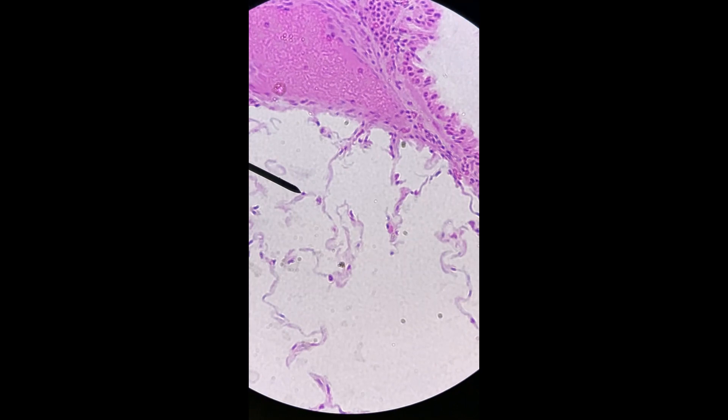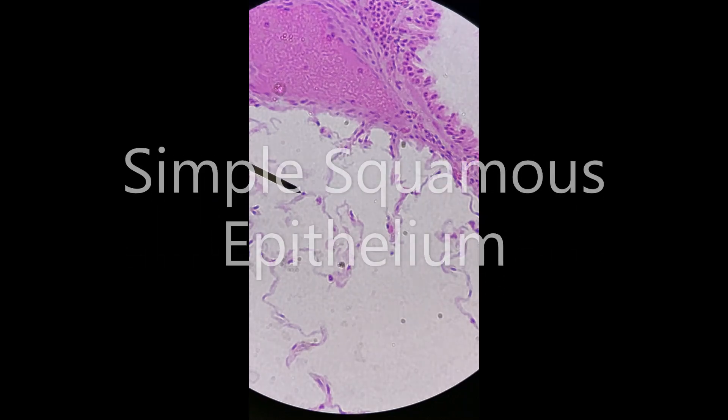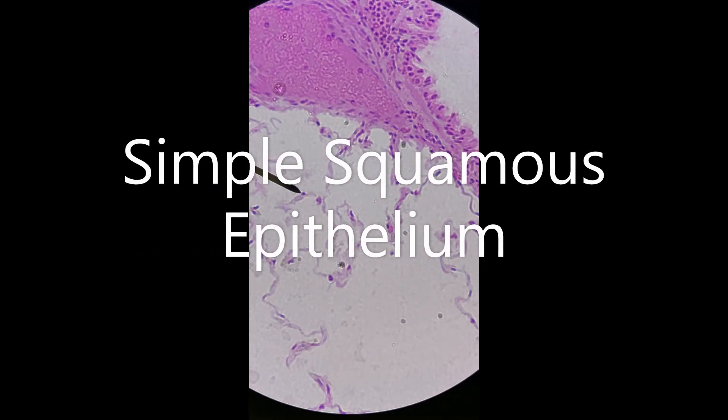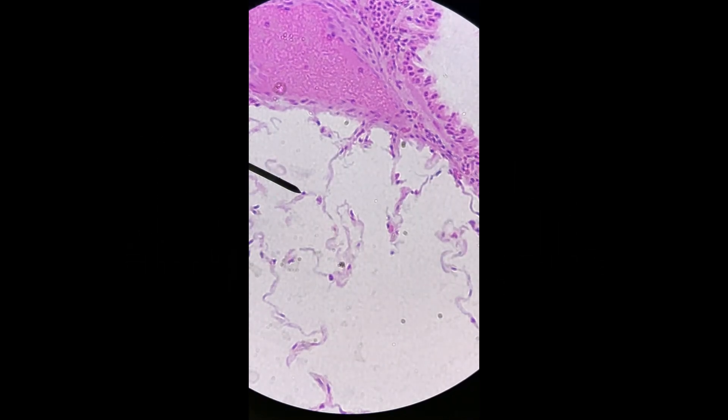This is a slide of a section of the lung. You can see it's at the highest power, so 400 times. The pointer right there is on one of the simple squamous epithelial cells that make up the majority of the inside of the lung.